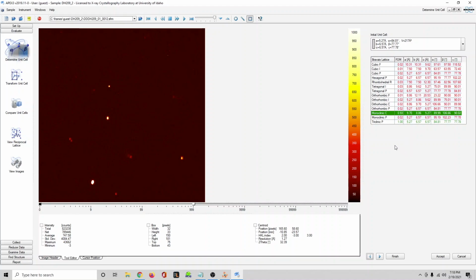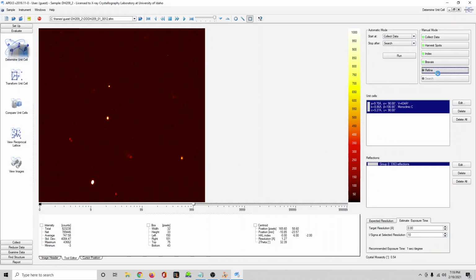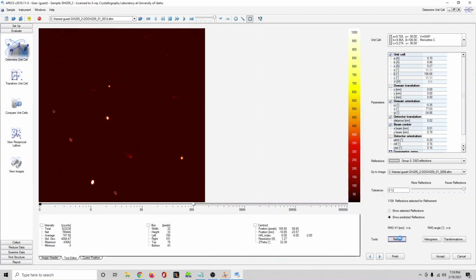If that's not the case, you might have to do some manipulating later on, or try to figure out in a reciprocal lattice viewer. And we're going to look at it anyways because I wanted to show you what a full collection actually looks like after I'm done refining this a few times. Because again, we have so many reflections, that'll actually give us a really good starting point. And it's not really necessary, but it does help the integration a little bit, because the integration is presuming that your lattice is correct so that it can fit a box around the intensity maxima and optimize the unit cell at the same time. So it's a way of approaching crystal structure and the data reduction if you're concerned about twinning.